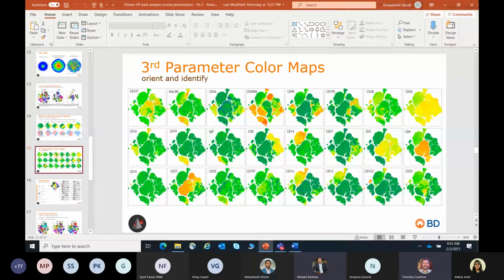Yeah, the 123s are a little island over on the left there, and I do see that too. So, I mean, that's a deficiency in the data. We'd have to go and look at the HLA-DR staining in this panel and dig into that if that were the case.